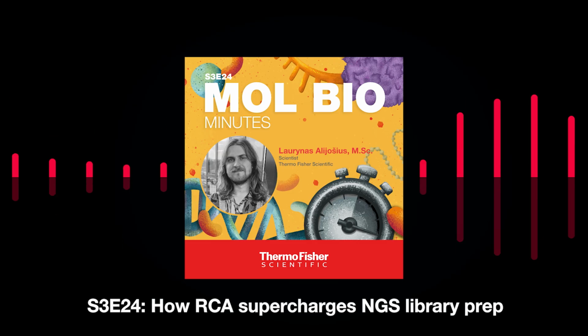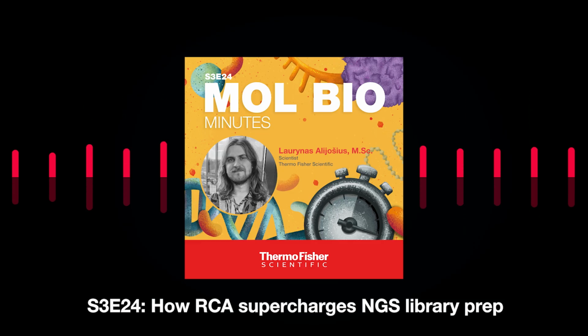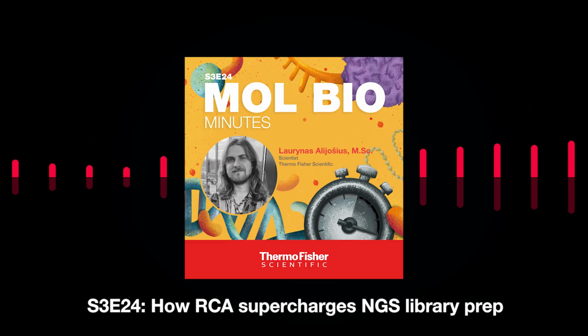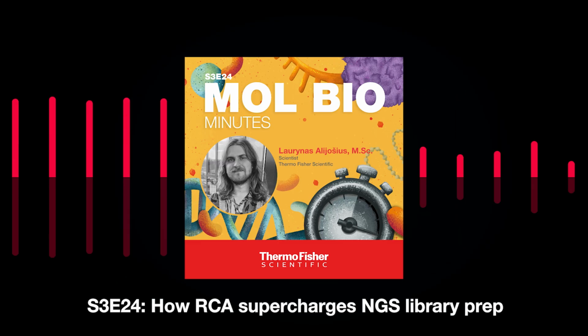They can help you amplify DNA from very low amounts of DNA or even from a single cell sample. So, when it comes to combining RCA and NGS, RCA is used before the NGS library preparation step. It is used for the amplification of your starting DNA material.